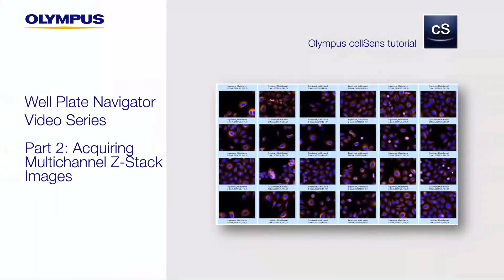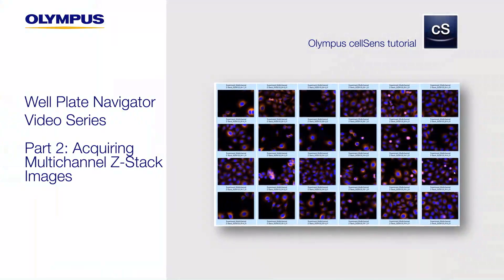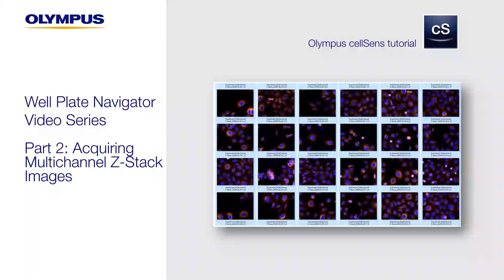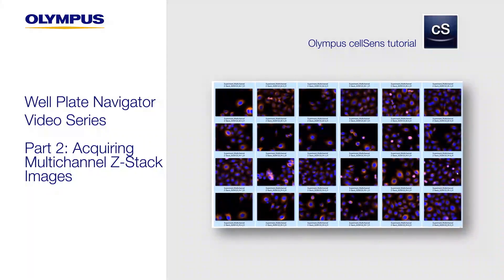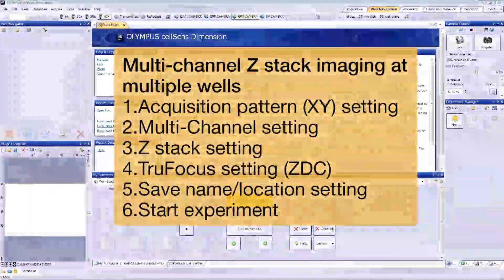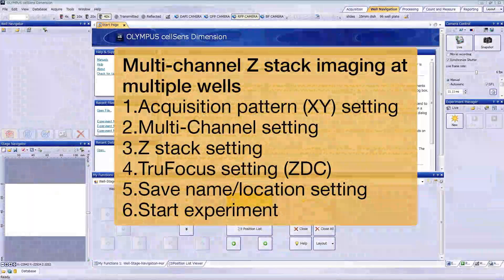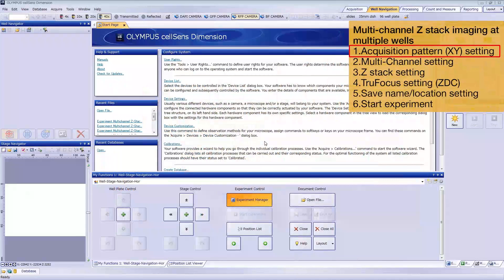In this second video of the Well Plate Navigator series, I'll show you how to acquire multi-channel Z-Stack images from multiple wells. If you haven't already, make sure you watch the first video in this series where I discuss the necessary preparation steps. Let's get started.